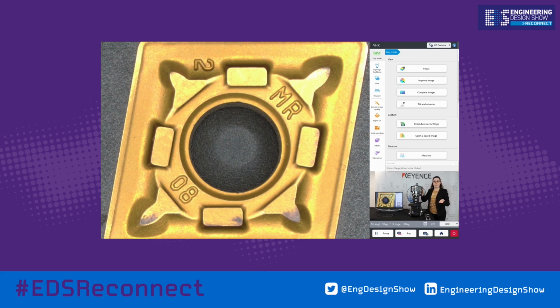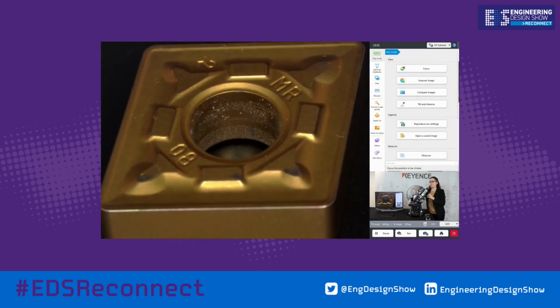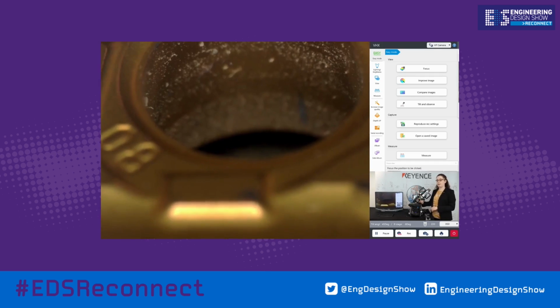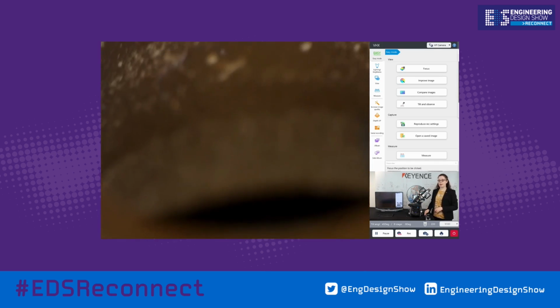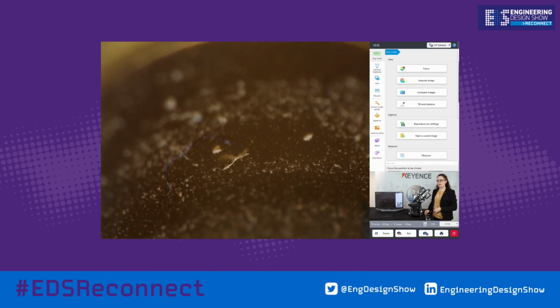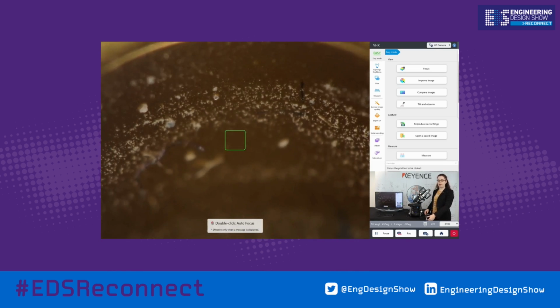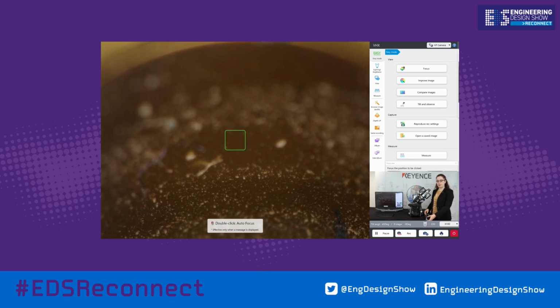Now, as I was saying before, if you view the sample from an angle, and then maybe also zoom in, let's do it right now, you typically only see this small strip of focus. So I'm going to zoom in here now so that we can see the centre of this cutting tool. And here we can see that single band of focus I was talking about. As I move the focus up and down, the band of focus moves. This is not very helpful when we just want to see the whole thing.